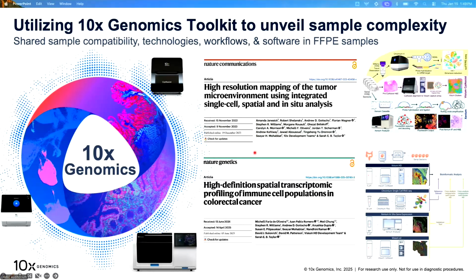No, it's a good question. It's a different technology, because with Visium, we hybridize those probes or we extract the RNA molecules, but the tissue with Visium stays behind. And so we use CytAssist to transfer either the probes or the mRNA from the tissue onto the gene expression slide.